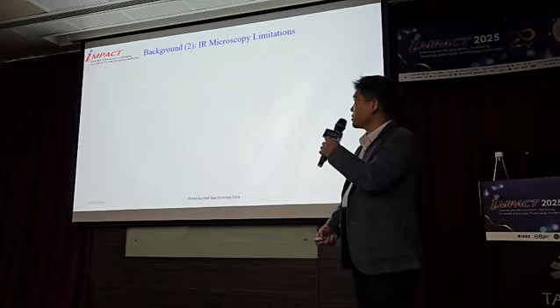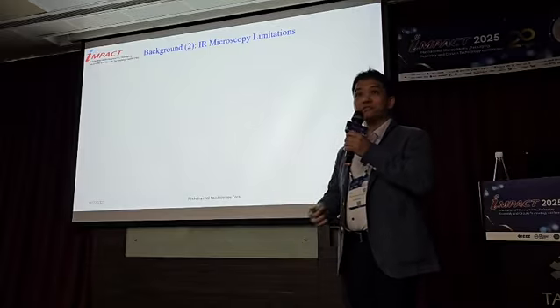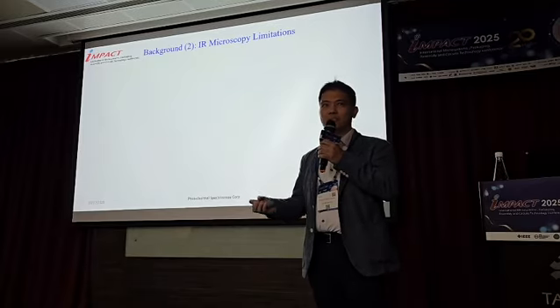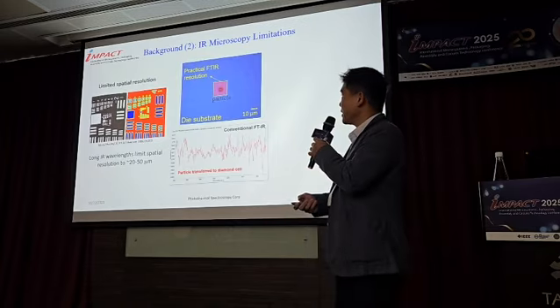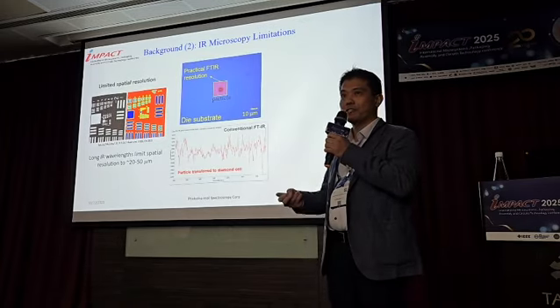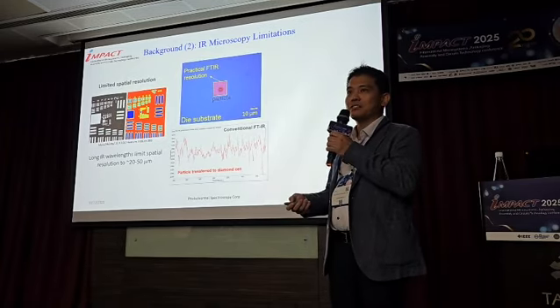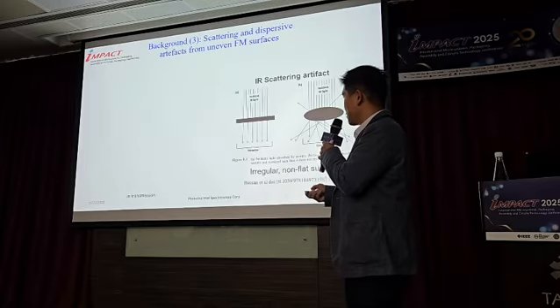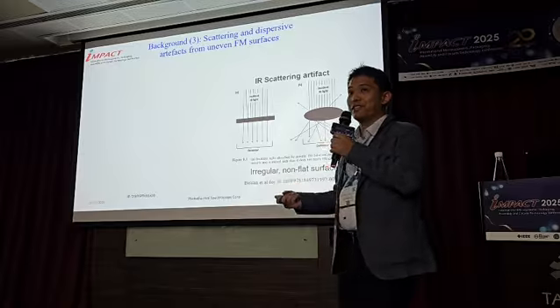All right, okay. So again, this is infrared, so we are looking at very long waves, 2.5 micron to 20 micron. And so oftentimes when we have small particles like these, it just makes it challenging to get useful information out of it. And it's not the only reason, really.